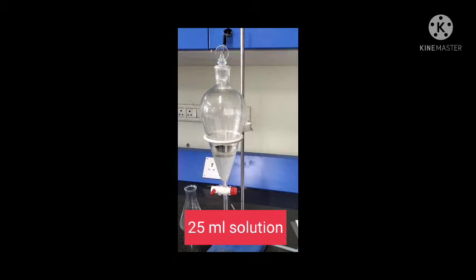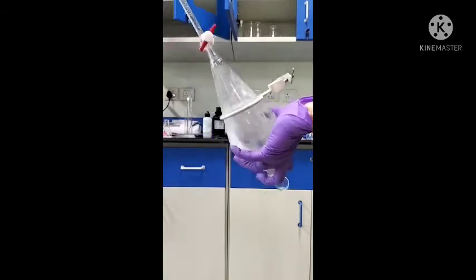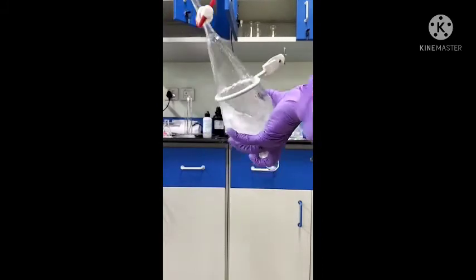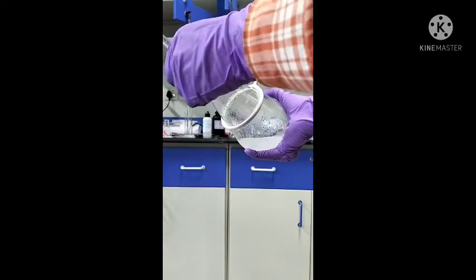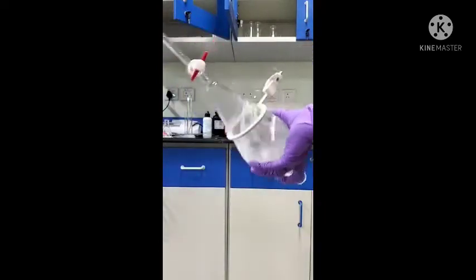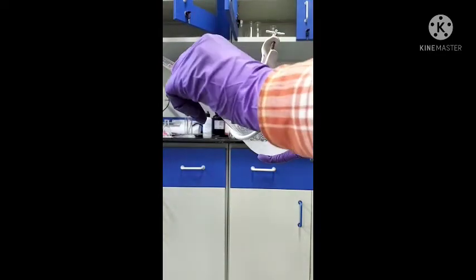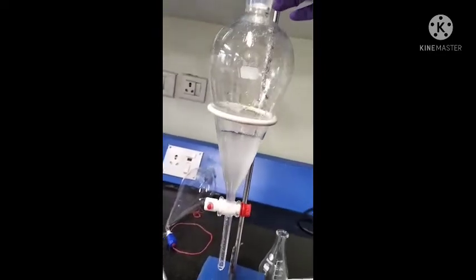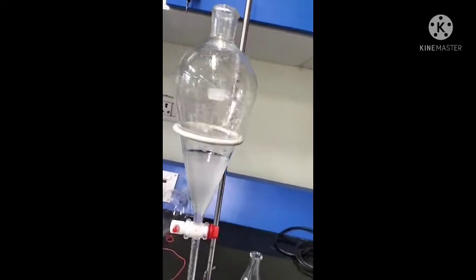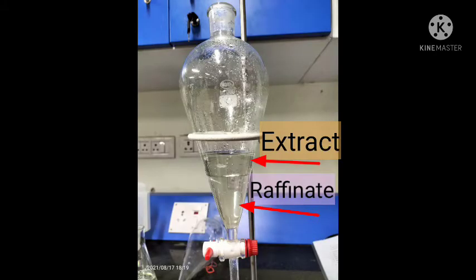Feed is already filled in the separatory funnel through the top. While the separating funnel is being shaken, the stopper must be held tightly in place and the stopcock must be tightly shut. After the separating funnel has been shaken a few times, release the pressure once or twice, then place it on the iron ring and remove the stopper immediately. Wait some time until the two layers are clearly separated.